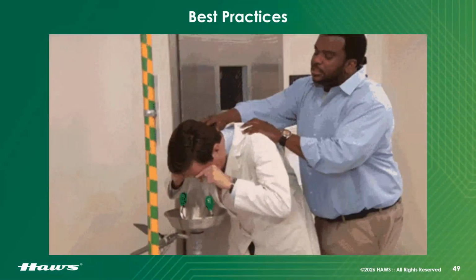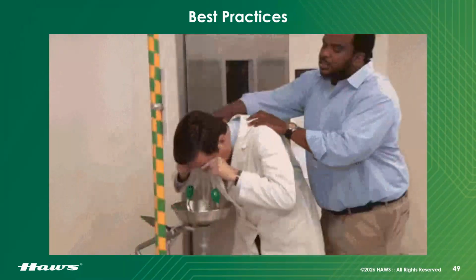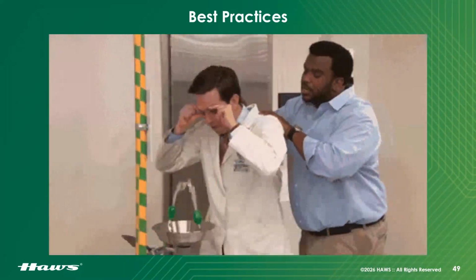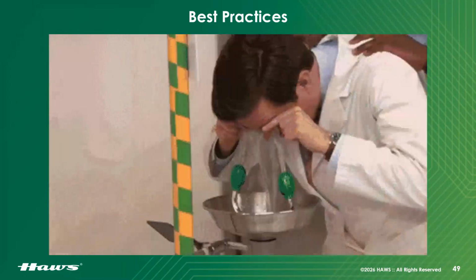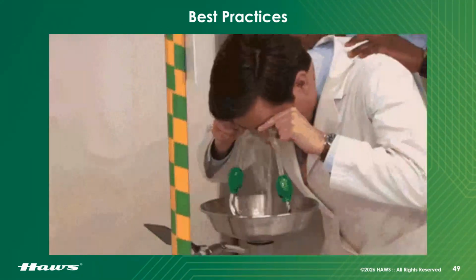All right, and as silly as this video is, the Nard Dog from The Office is killing it in his technique. As you can see, he's really peeling those eyeballs back. So it's exactly what you want to do, even though he's screaming the entire time.